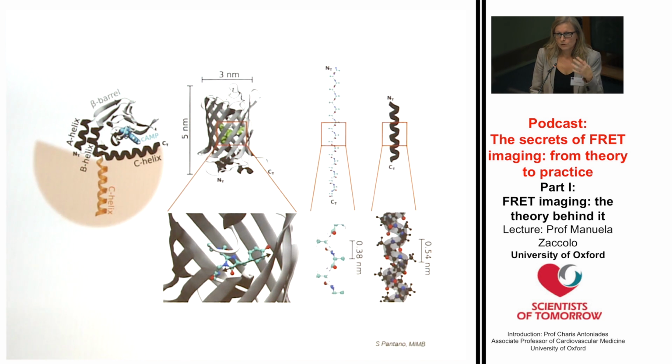And here again, it's very difficult to predict the final conformation of any peptide when it is incorporated in a more complex three-dimensional structure. But there are some basic rules that one can consider. For example, in a non-structured polypeptide chain, the distance between two alpha carbons is about 0.38 nanometers. And if the amino acid sequence of your peptide will lead to an alpha helix fold, then one should consider that the pitch between two consecutive turns is about 0.54 nanometers.